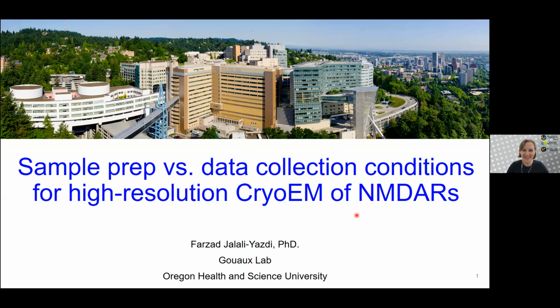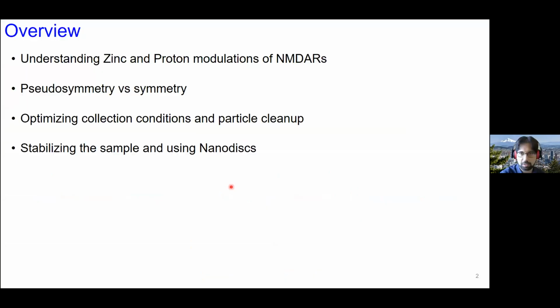Excellent. So thanks, Jeanette. As she said, I'm now a postdoc here at Oregon Health and Science University in the Gouaux lab, and I work on trying to understand NMDA receptors by cryo-electron microscopy. And today I'm really going to focus on how we were able to improve the resolution of our reconstructions from around 6 to 8 angstrom to much higher by the end of the talk.